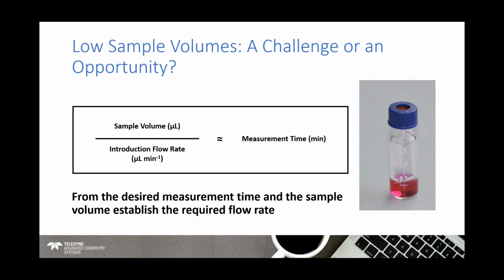You know the measurement time that you're interested in obtaining, you know the sample volume that you have, and then from there you can establish what introduction flow rate you need to be delivered by the MVX through an appropriate nebulizer, and then you can realize the data that you want from this.